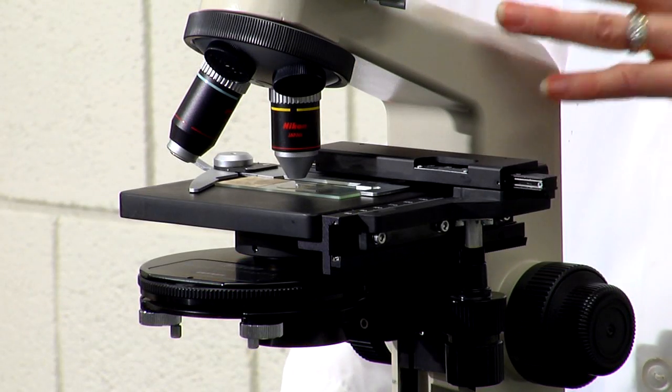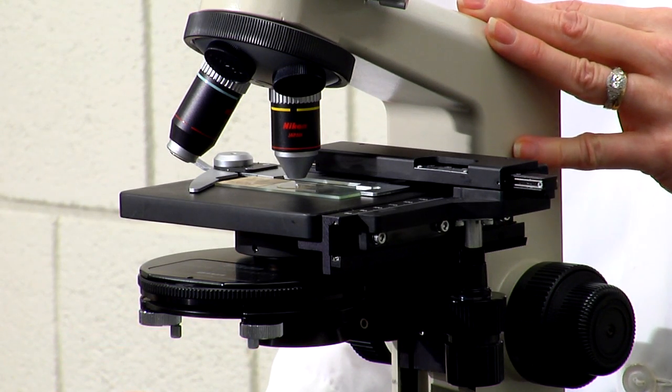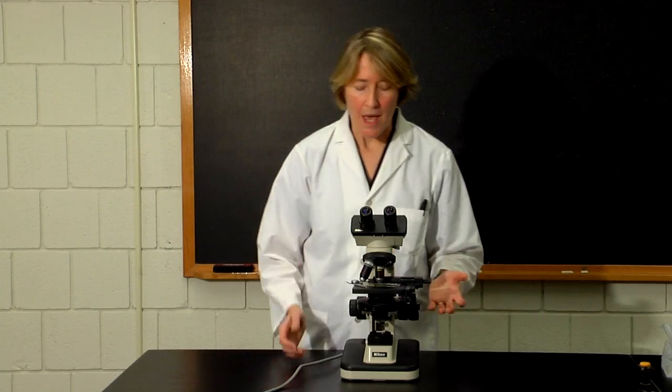If the organisms or objects are clear, they may need to be stained to enhance the visualization by brightfield microscopy. The disadvantage of brightfield microscopy is that staining usually kills the organisms. But let's begin using brightfield microscopy.